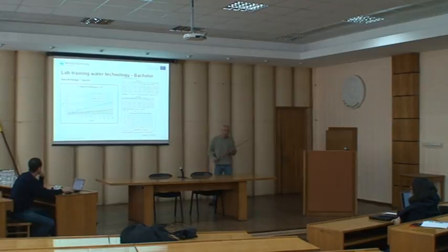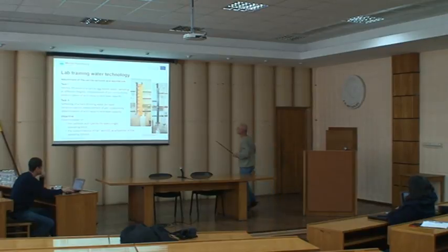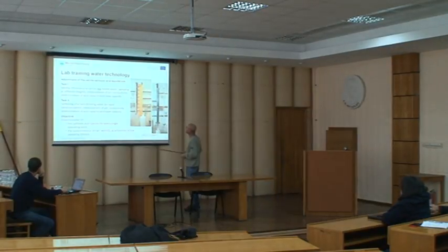Some chemical engineers should know it here, which are related to the design of such systems. You got the NTU, HTU, and the NTU factor for the height and the diameter dimensioning of columns for the exchange. This is a lab training, hardening and softening of water.